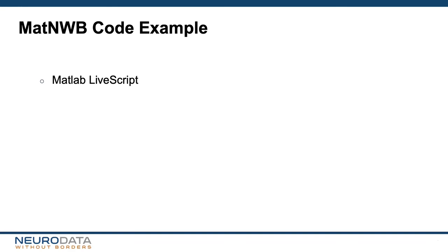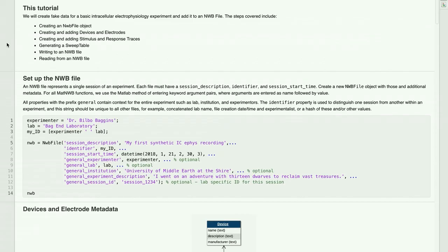Now we're going to look at a MATLAB LiveScript with a code example to generate an NWB file using MatNWB. In this tutorial, we will create some data for a basic intracellular electrophysiology experiment and add it to an NWB file using MatNWB. An NWB file represents a single session of an experiment. Each file must have a session description, an identifier, and a session start time. We use the NWBFile constructor to create a new NWB file object, including those fields as well as additional metadata. For all MatNWB functions, we use the MATLAB method of entering keyword argument pairs, where arguments are entered as a name followed by a value.